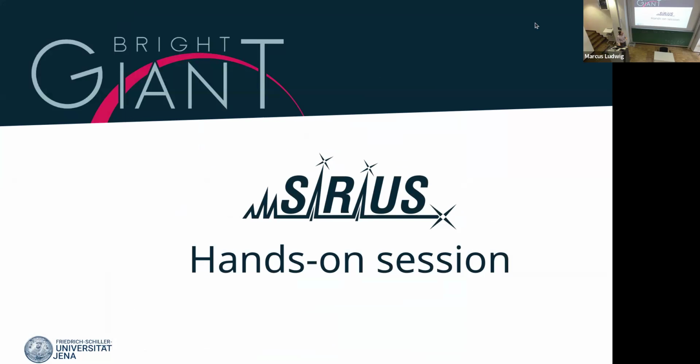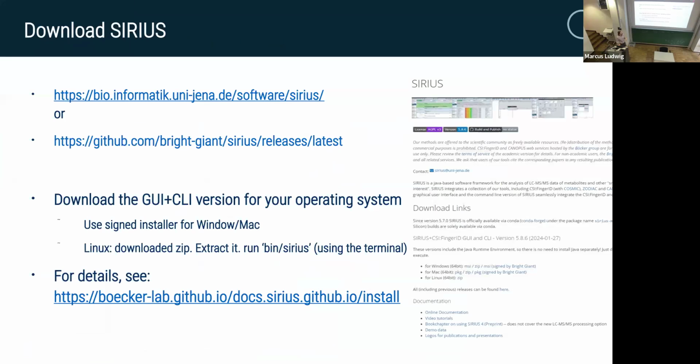But first we start here. So you now hopefully have downloaded Sirius. Is it working for everyone? Has someone not downloaded yet? Perfect.